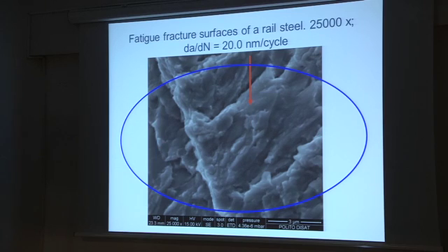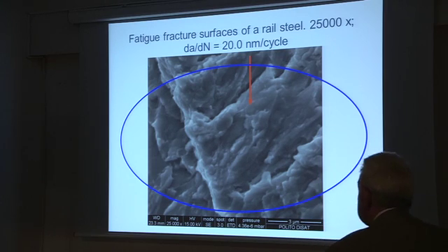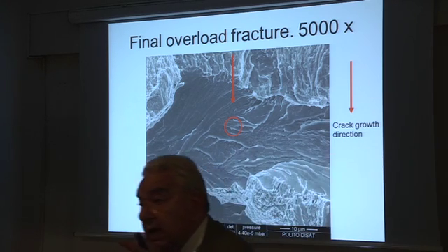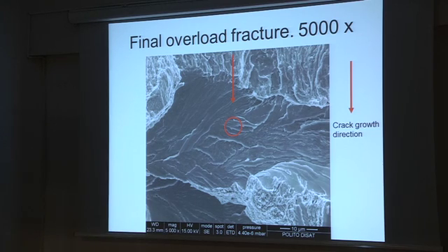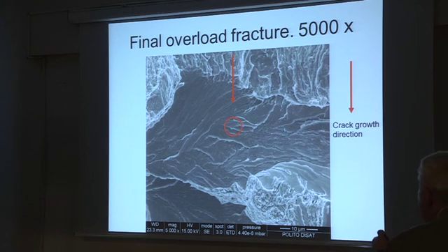Since we are here at this stage, we can see how is the final fracture. The final fracture is a brittle fracture. This is at room temperature. Remember the C85 steel, the 0.85 percent carbon steel that we were seeing in the beginning, that had very low variation of absorbed energy. And this is the fatigue. This is the final overload fracture.